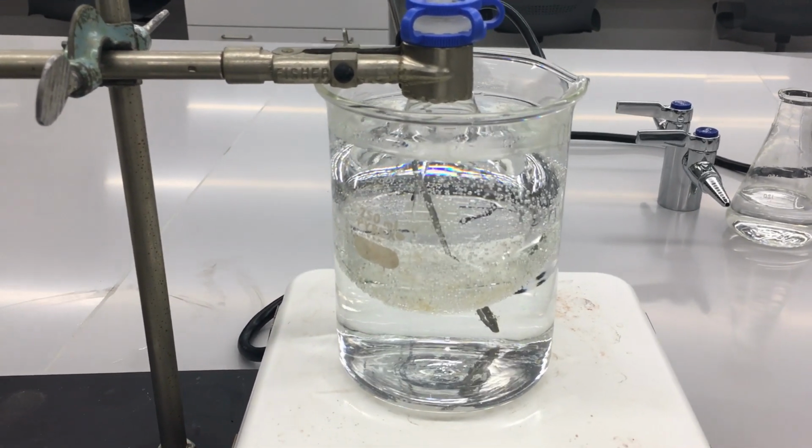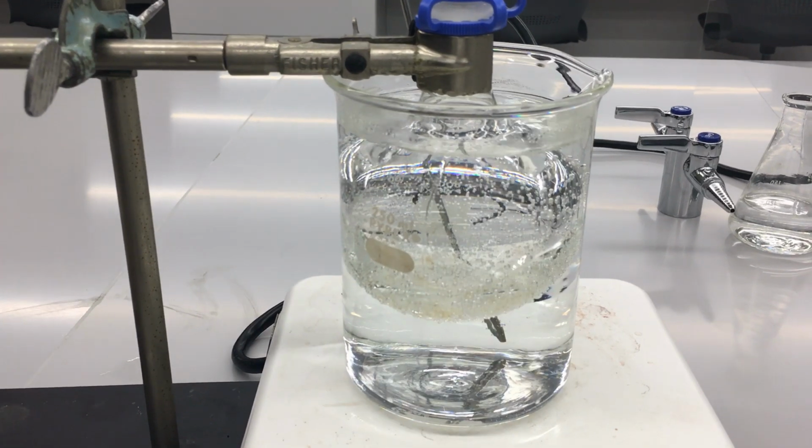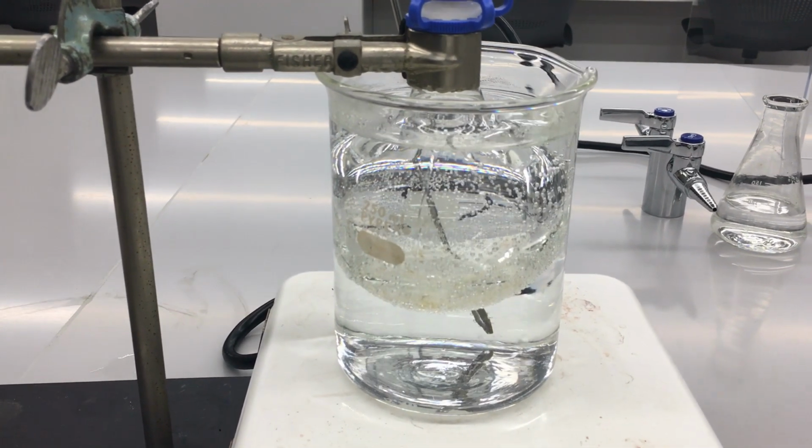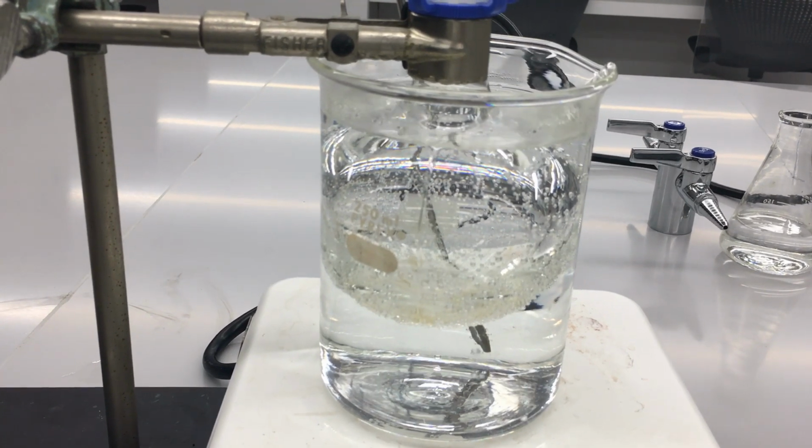So to remind you what's going on, during this time, the liquid inside of this round bottom flask is being vaporized, so we can then find the total volume, which will be the volume of this round bottom flask later.